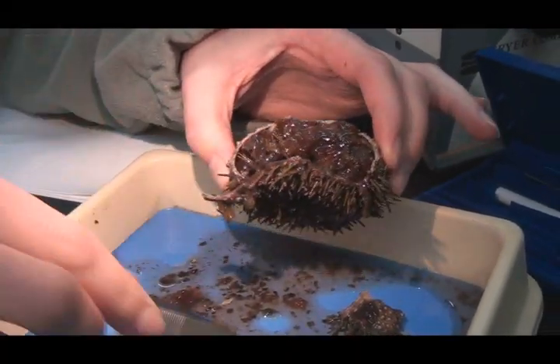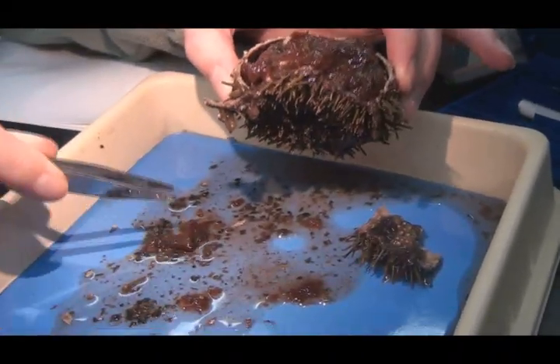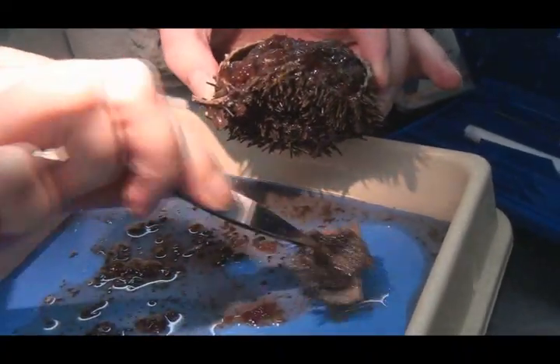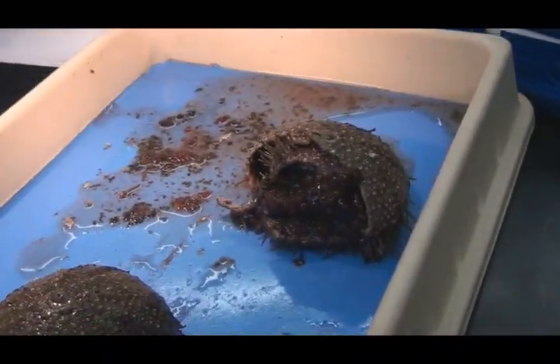Well, that about wraps it up. Now that you're done dissecting your urchin, you should put it back together. Don't forget any pieces because you may want to dissect it again. Put that test back in place. Perfect. Well, that's the end — thank you.